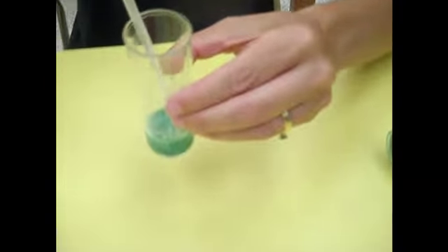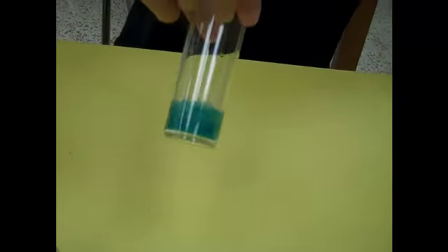Okay, and the idea is that you get it wet without getting it completely soupy. So you want it to be completely blue, but you don't want it to be so liquid that it's running around. That sometimes takes some getting used to. Like if we look in there, I think that probably needs just a little bit more water, because I'm still seeing dry flakes, but if I add too much, it's going to get too wet.